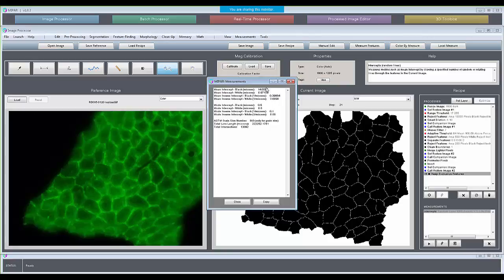So you're getting different answers because you're running a set of random lines. The variation between those instances is not to be considered as the confidence that you have in the precision of that measure, or in the overall confidence that you've measured these features accurately.